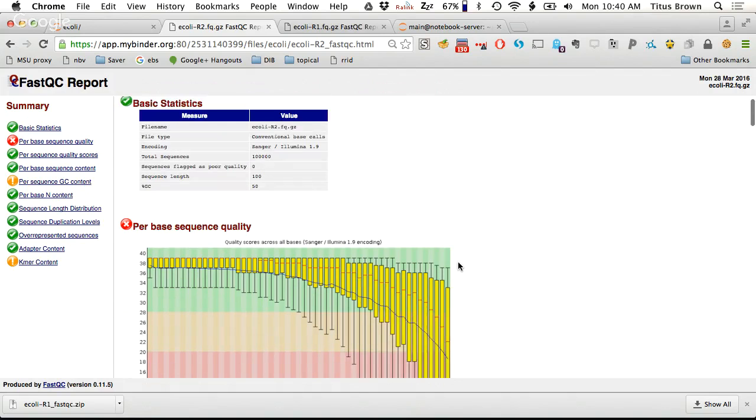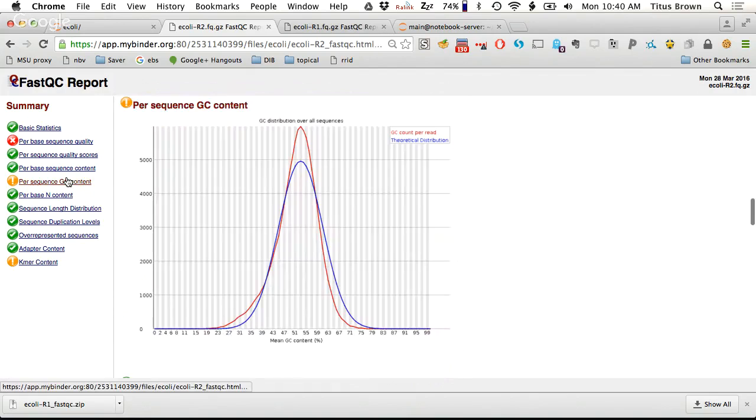Yeah, sure. The per-sequence GC content, yes. If you did see some skew, there are some organisms that are like 30%. So could that also just be a thing of the organism? Actually, I have a biological reason for it. In this case, what it's doing is the GC count per read, and it's comparing that to the theoretical distribution based on the average GC content of all your reads. If you had a systematic skew due to the composition of your sample, it would shift appropriately.